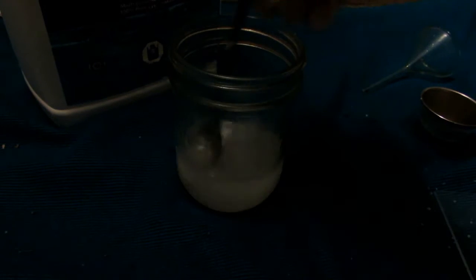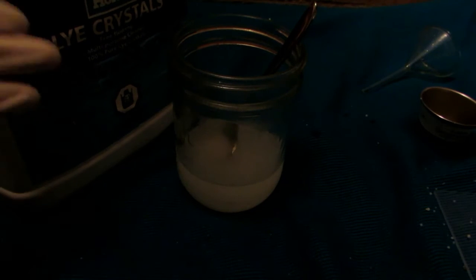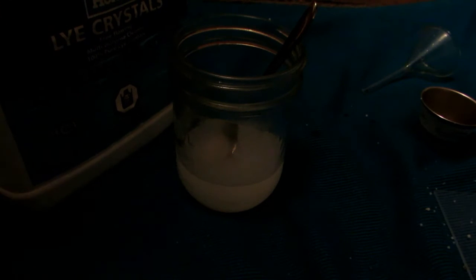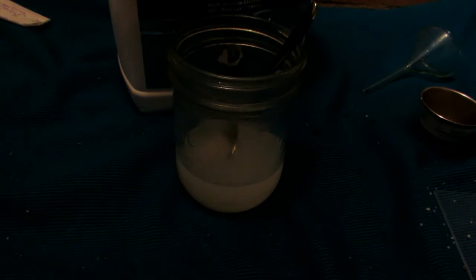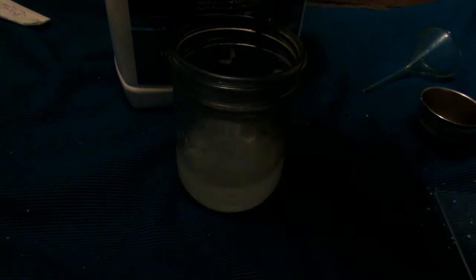We'll make sure everything is dissolved until we have a nice clear solution. You can buy sodium hydroxide as lye crystals from places like Home Hardware, which is where I got this. You can also check some drain cleaners, but just make sure it says sodium hydroxide or pure lye crystals. This is fairly cheap — about 16 dollars for 6.6 pounds of it.